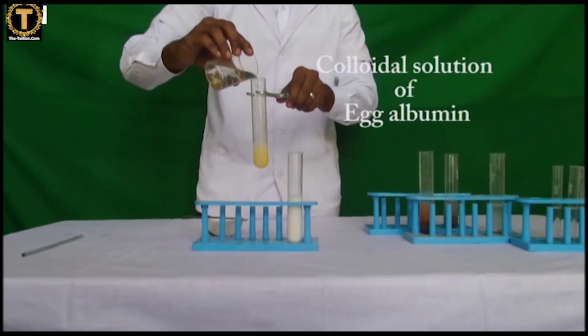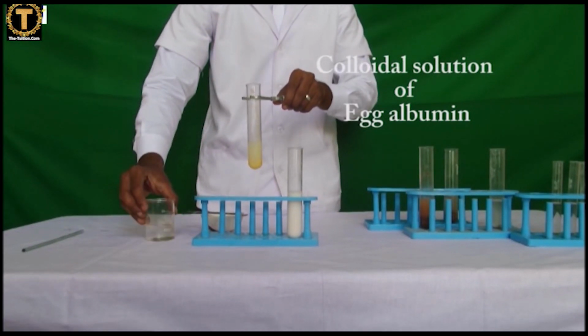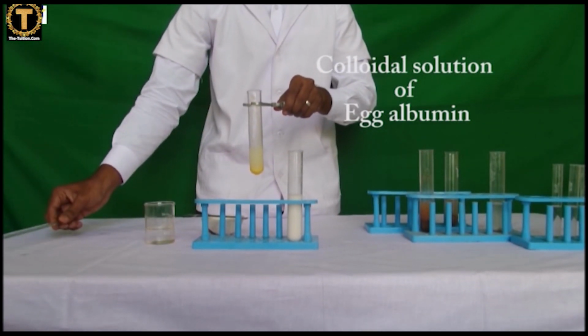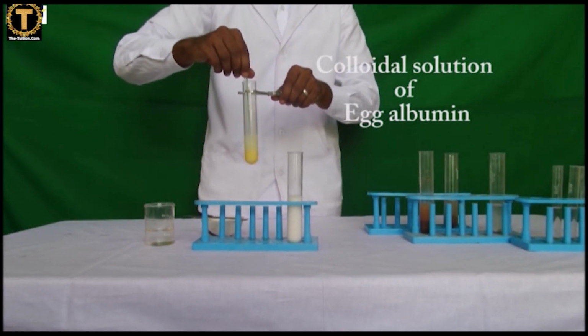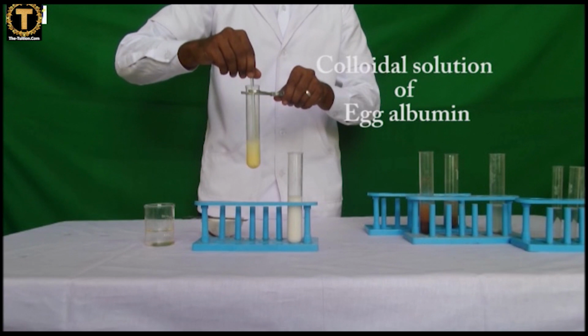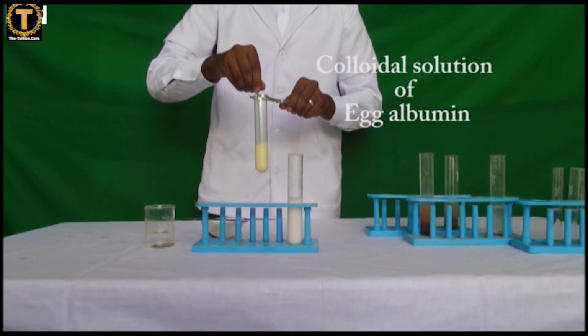Colloidal solution of egg albumin in water. Take 10 ml of warm water in a test tube. Separate the white portion of the egg from the yellow part. Add a very small quantity of egg albumin to the test tube. Stir the contents thoroughly with the help of a glass rod.